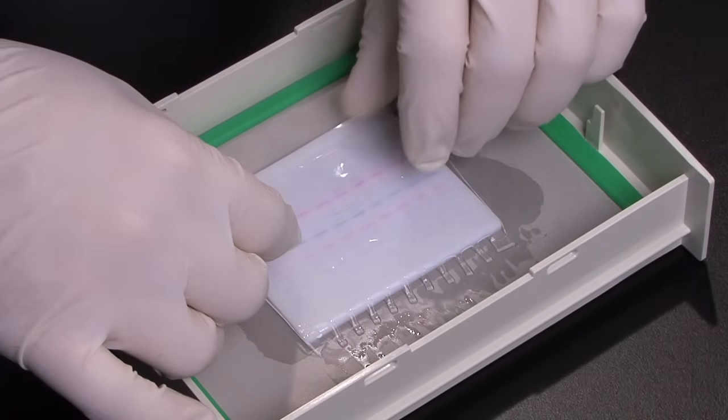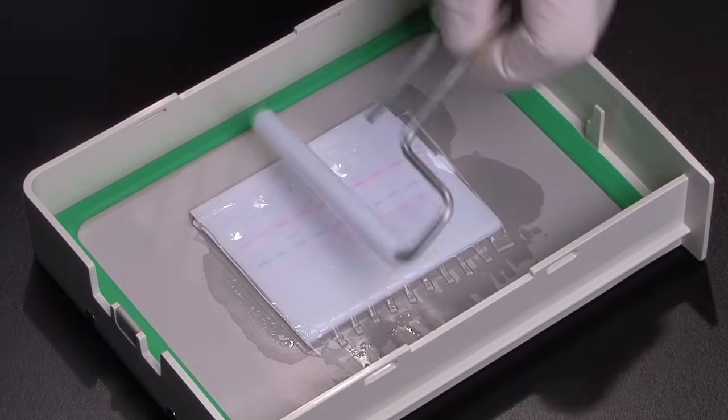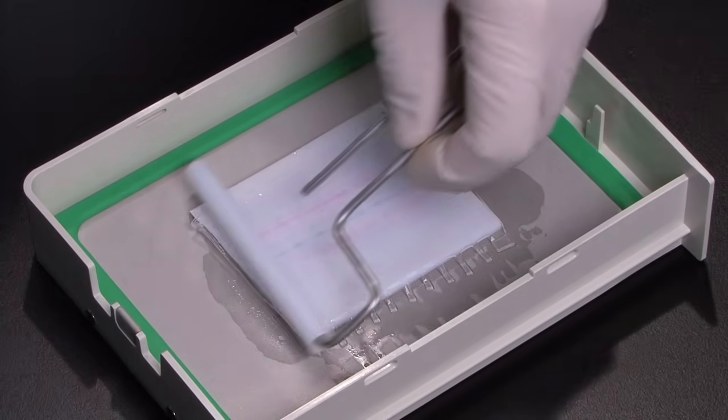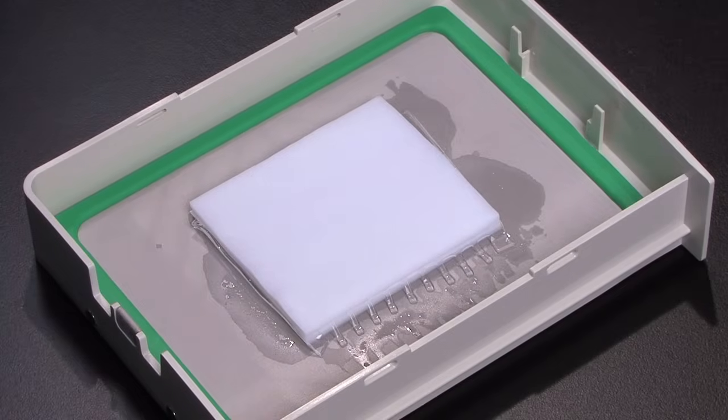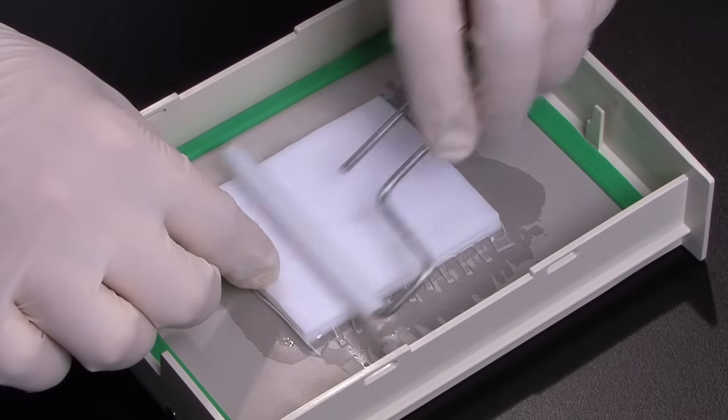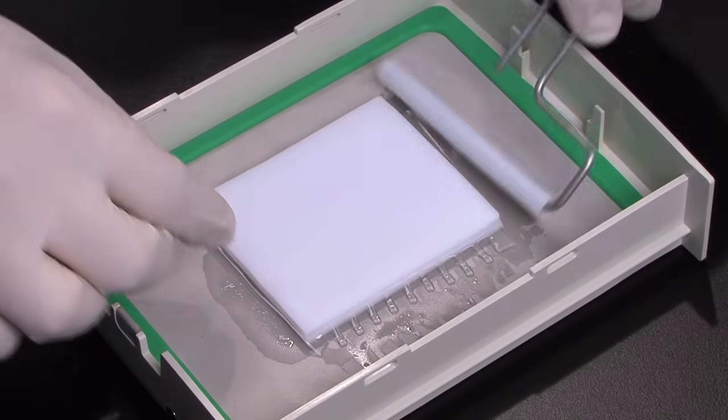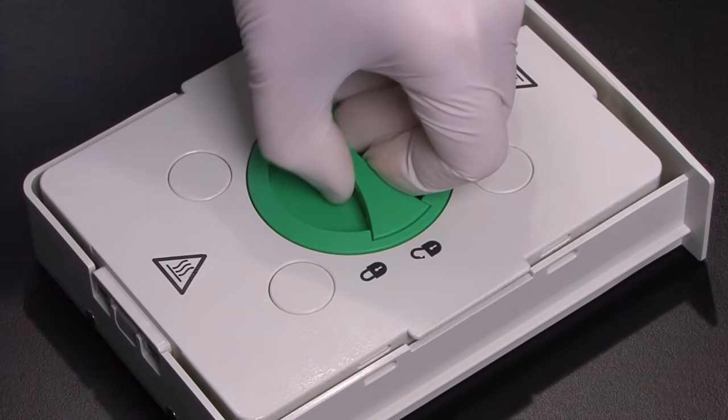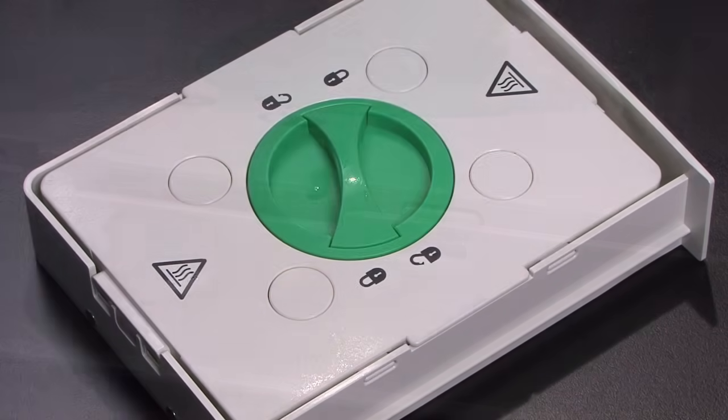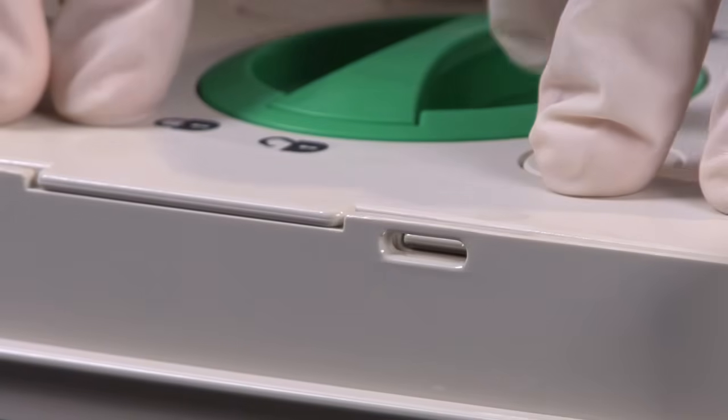Lay your gel on top of the membrane. With the trans-blot turbo, there is no need to equilibrate the gel and transfer buffer. Next, place the top stack on the gel. Roll again to remove bubbles. Place the cassette cover on top of the sandwich. Press down firmly and turn the knob clockwise to lock. You will know it's locked when you feel a click.